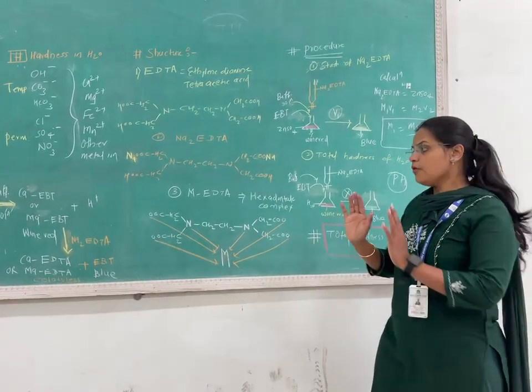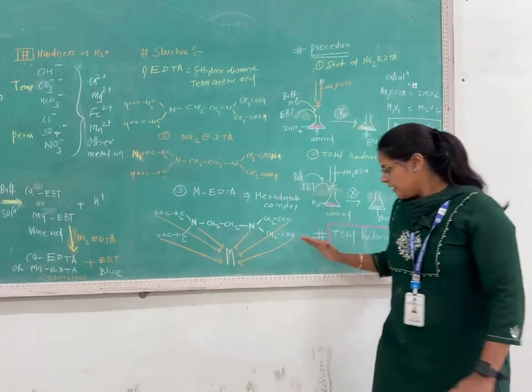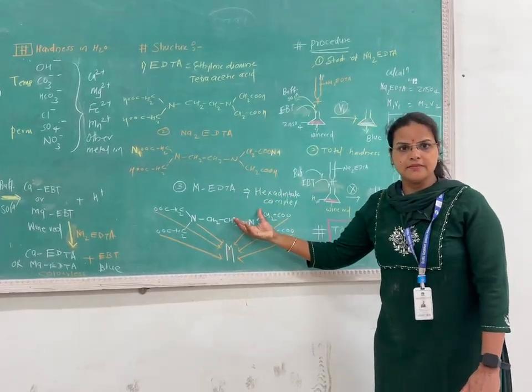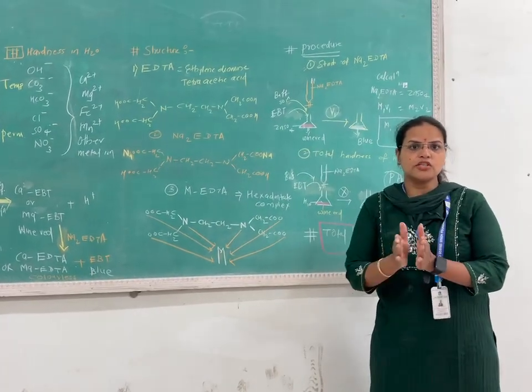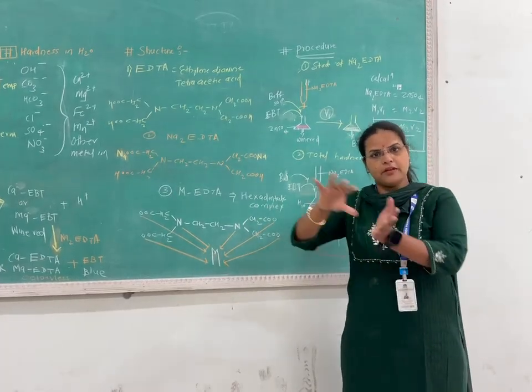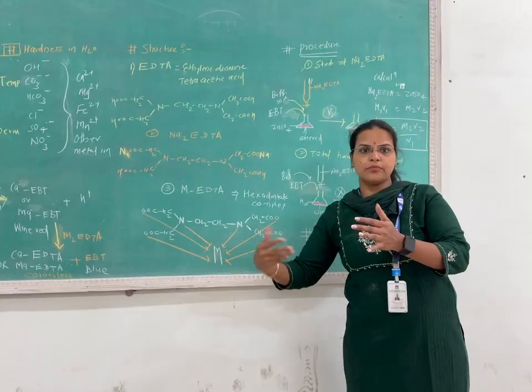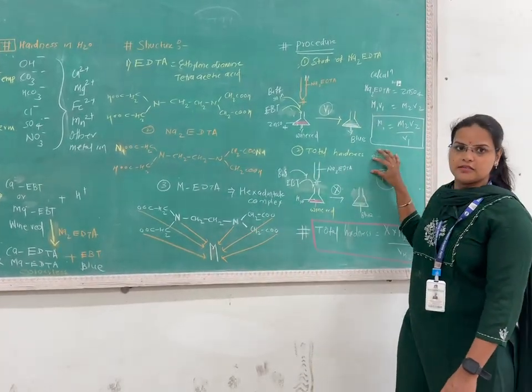Now here, how do we find the permanent hardness? In this case, we again take a water sample in a beaker and boil it. Whatever temporary hardness causing salts are present in the water get precipitated out. Filter that water. The filtrate is used for finding the permanent hardness.